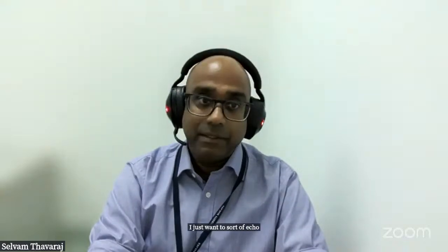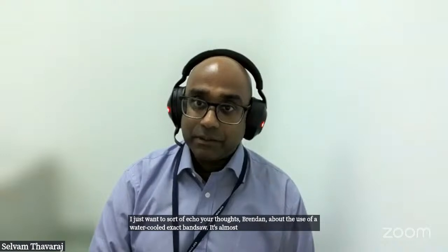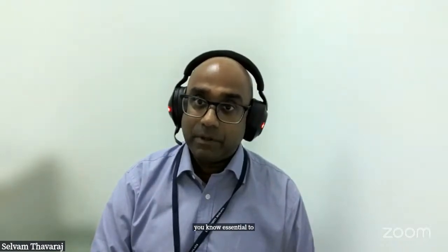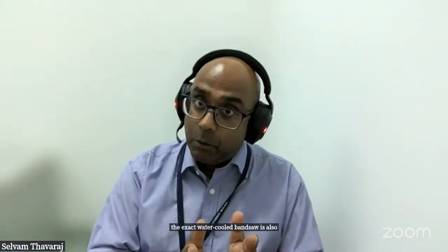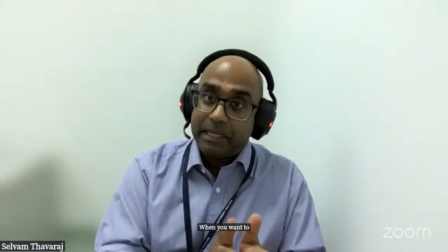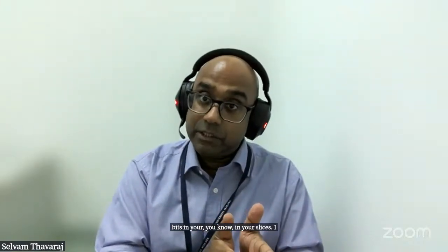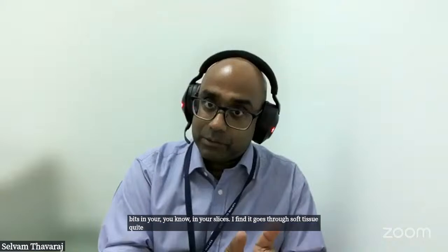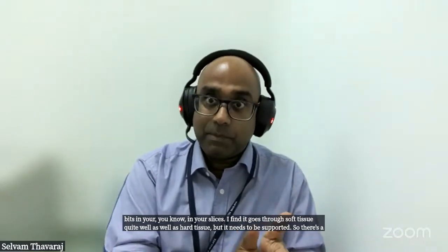I just want to sort of echo your thoughts, Brendan, about the use of a water-cooled Exakt bandsaw. It's almost essential to head and neck pathology laboratories. We've always used that as well, and I think the Exakt water-cooled bandsaw is also quite useful when you want to incorporate soft tissue bits in your slices. I find it goes through soft tissue quite well as well as hard tissue, but it needs to be supported. So there's a bit of an art to supporting the soft tissue bits when you go through it.